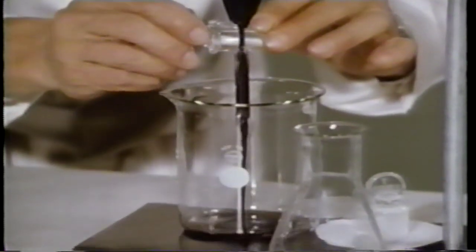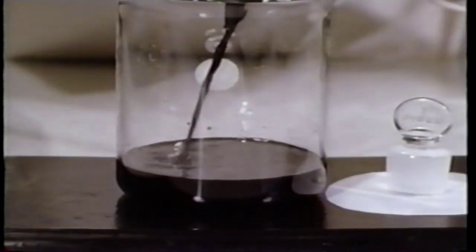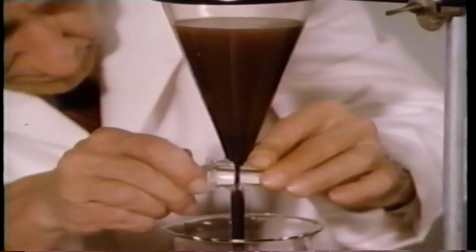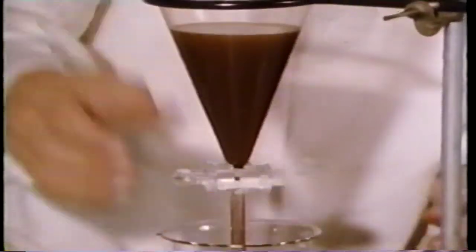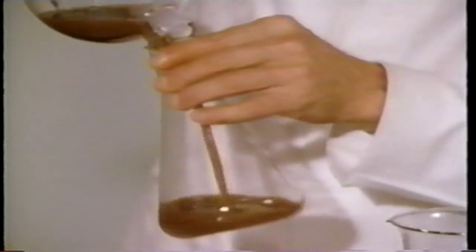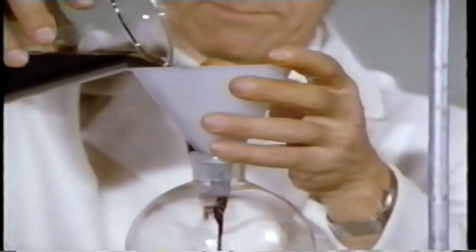When this aqueous layer has completely settled, it can be drawn off. The last of the aqueous layer is coming out. There. Most of the desired product ketone is in this remaining ether solution. Set it aside for now. The aqueous layer is returned to the funnel.